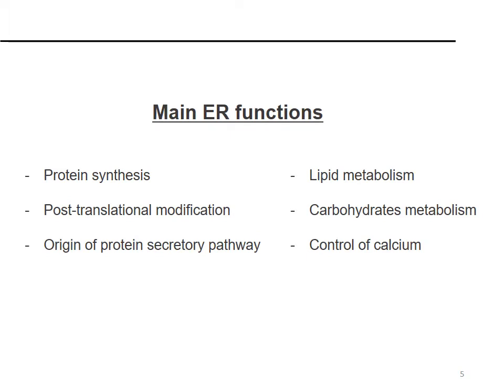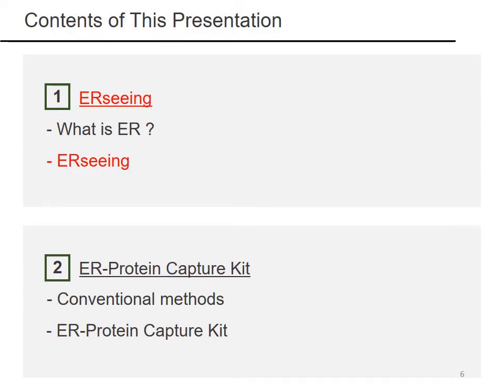The main ER functions play essential roles in protein synthesis, post-translational modification, origin of protein secretory pathway, lipid and carbohydrate metabolism. Subsequently, I'll talk about one of our new reagents, ER-seeing.